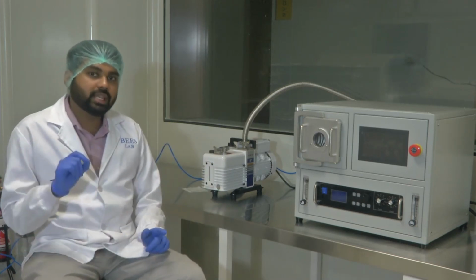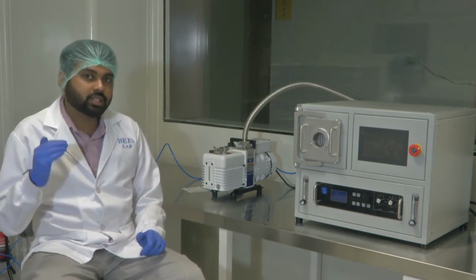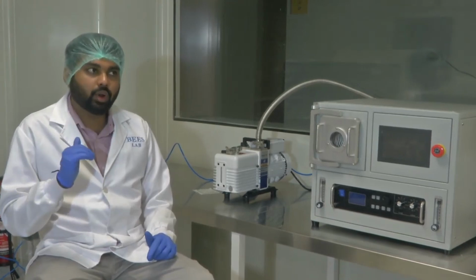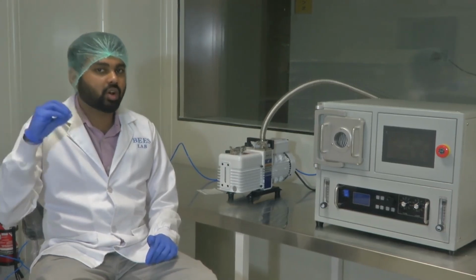At that point, you can see the pressure increasing. Initially, when you are creating vacuum, pressure will drop. Then you can see the pressure increasing because the oxygen molecules are coming in. So the oxygen molecules come in and fill the chamber. Now it's a more definite chamber. You know that this chamber is now constituted of 99% oxygen.